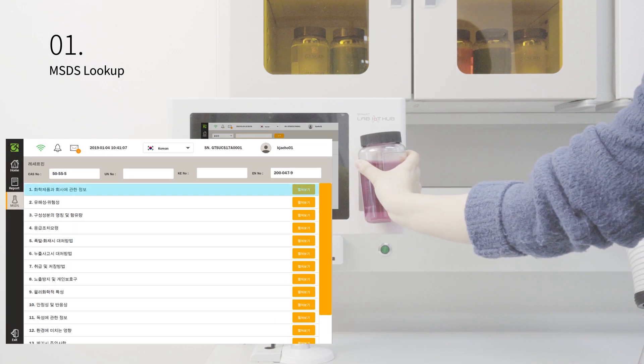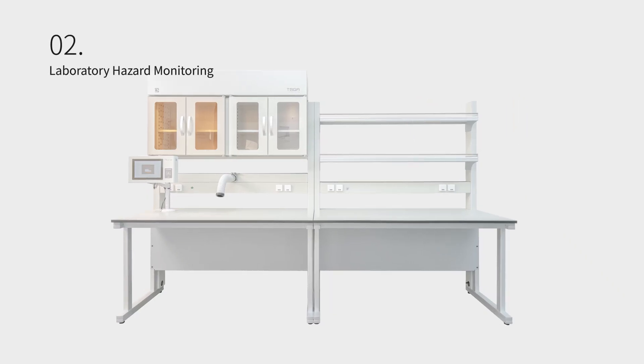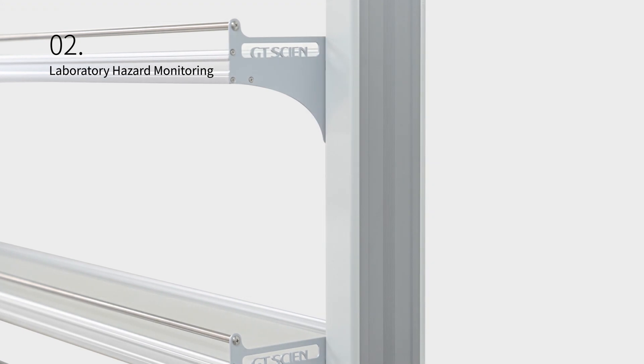Chemical usage is tracked and provides key data points for safety managers to better protect laboratories, researchers, and other personnel.